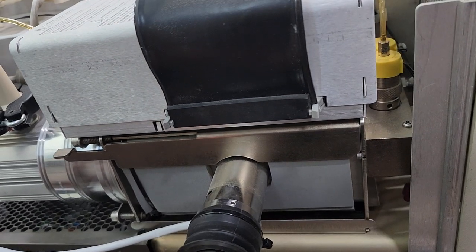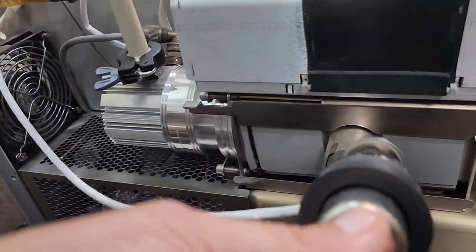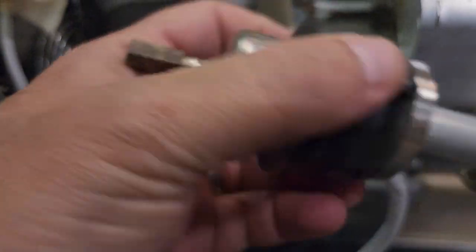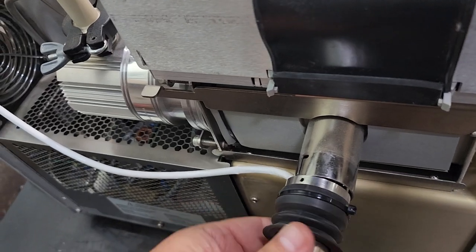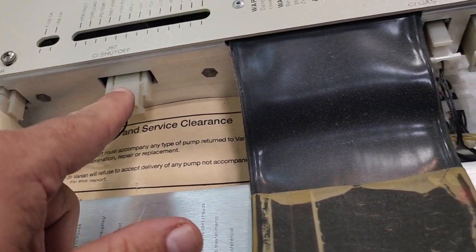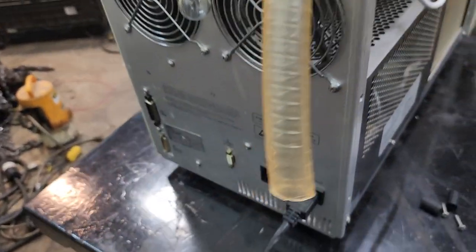It comes with it, and this also has something to do with it. This piece I see is also for sale. I don't see a number on there other than it says transfer line heaters. Trap heaters are in there. It's got manifold heaters set up and CI shutoff. Unit's complete.